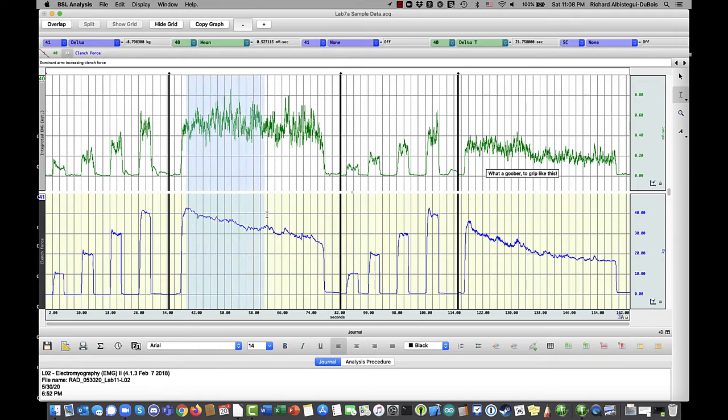And then it shows increasing negative numbers there under delta because the force is dropping off. So it's saying at this point you are 18.55 kilograms less than where you started. That's the negative. If I clicked and went back this way, it's saying from where you started to where you're dragged to, you're now 18 kilograms greater, and so on. So you get the idea. Delta is just the difference in value.